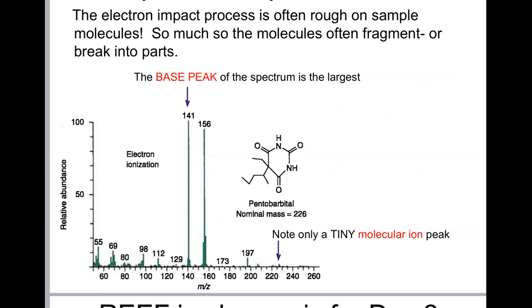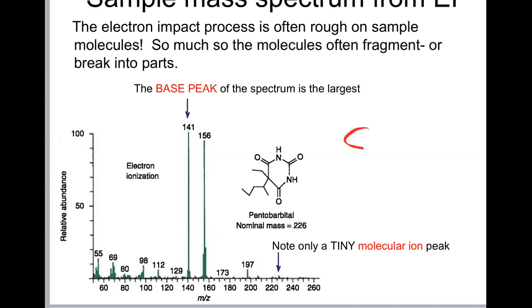Okay, so GCMS is used a lot in analytical labs throughout the world. Very popular method. Again, the instrumentation is not particularly cheap. However, the data that you get is just remarkably informative, and that's why people use it.